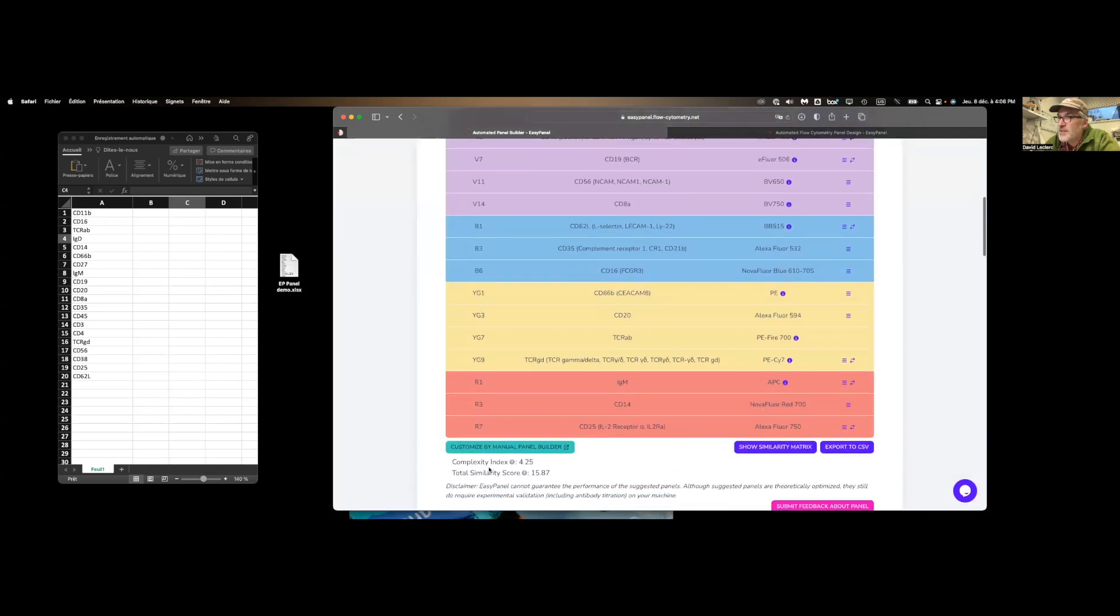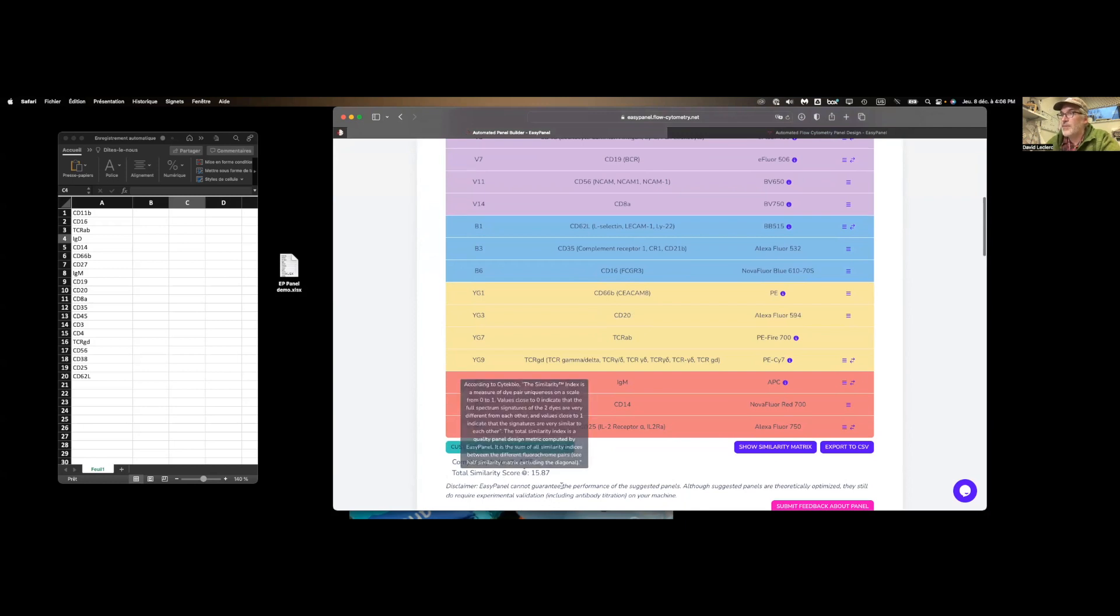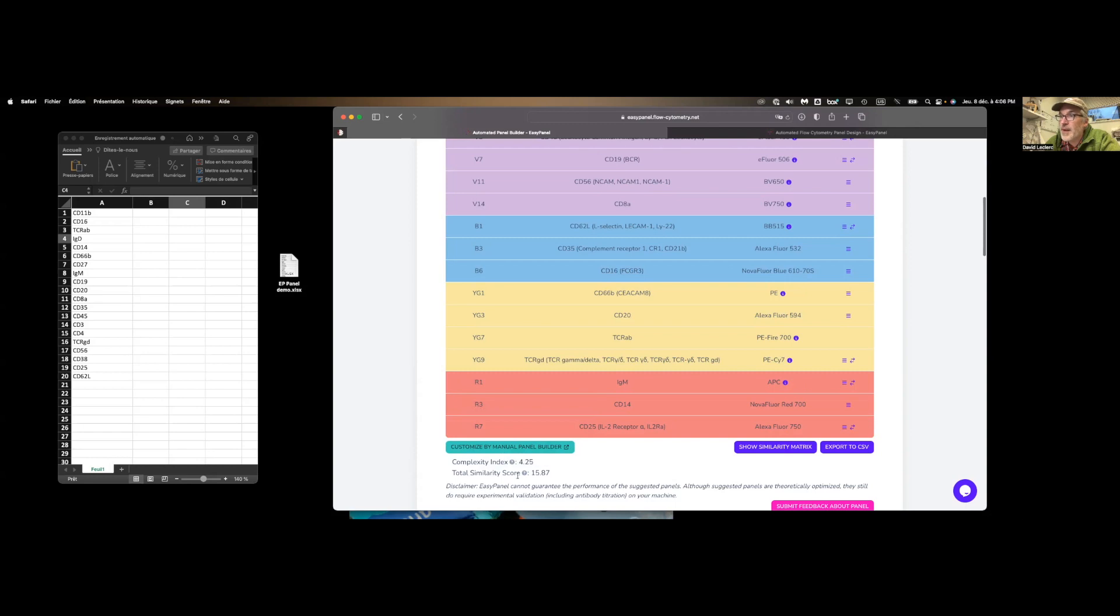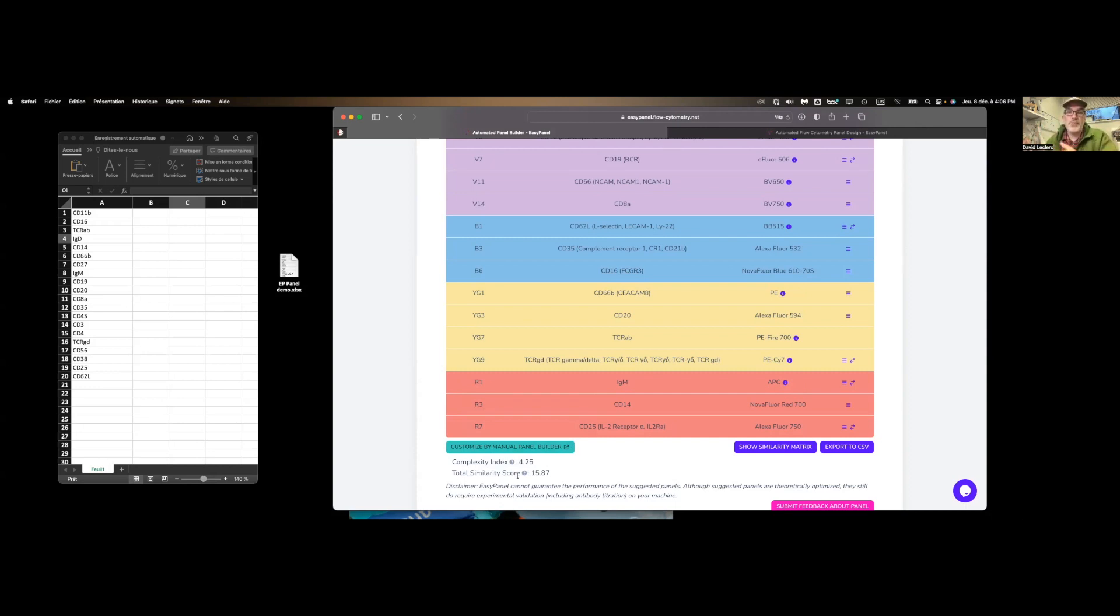you find your complexity index and total similarity score. So this pairing has been optimized for minimizing the complexity score, meaning with this panel, presumably you'll get the best resolution power to resolve your markers.